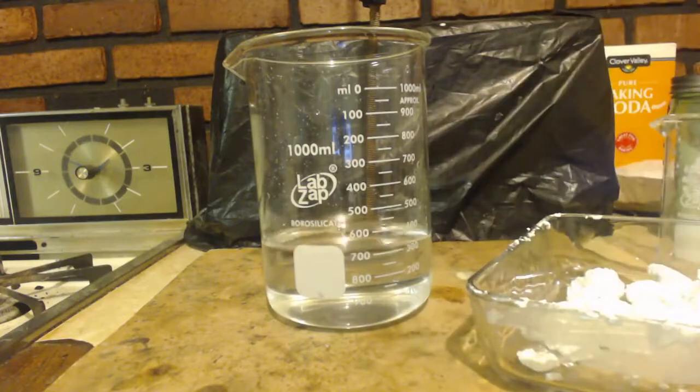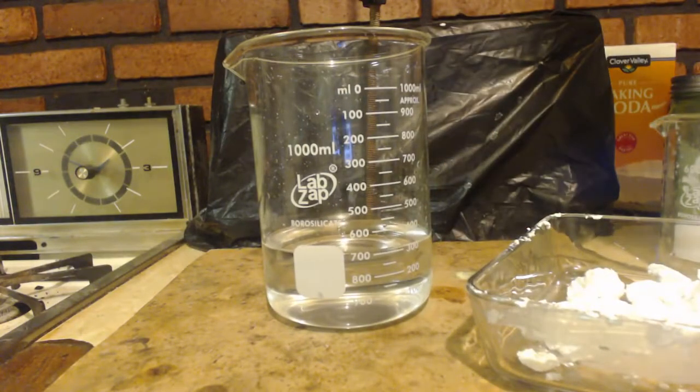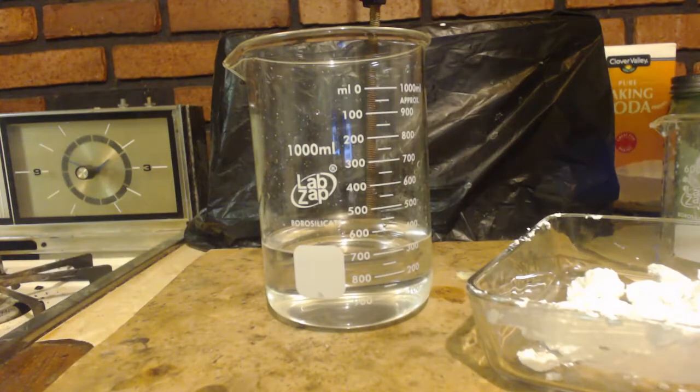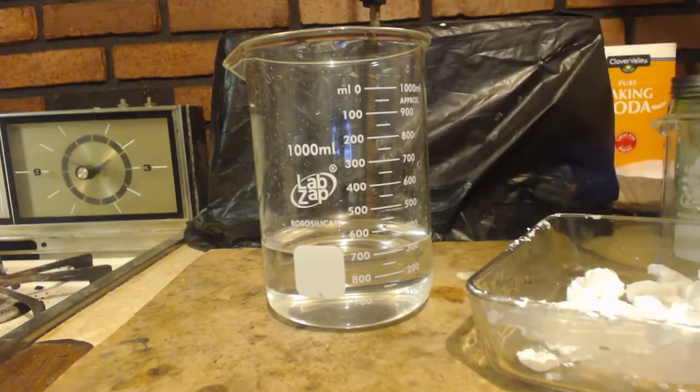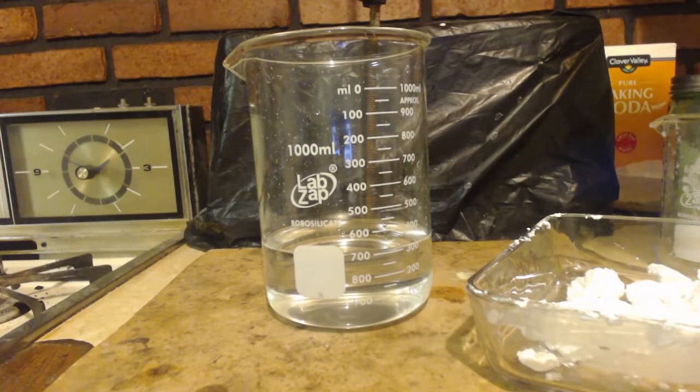Now what's left, if we took all the calcium ions out and we took all the sulfate ions out, the only thing left in there is ammonium ions and chloride ions. So the only thing that should be in solution right now is ammonium chloride. Keep in mind there might be a fifth of a gram of calcium sulfate in there too.